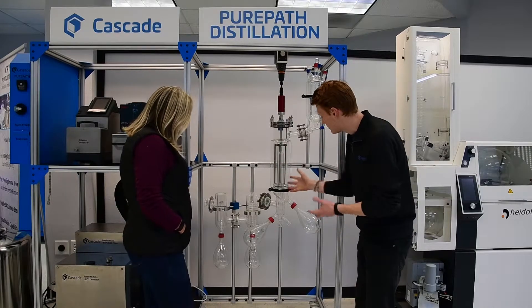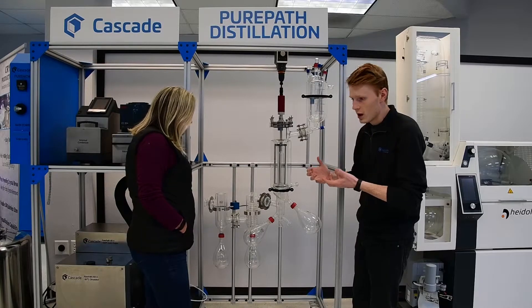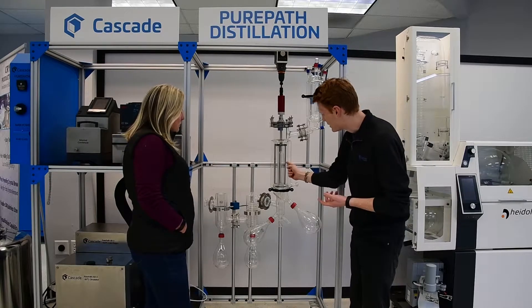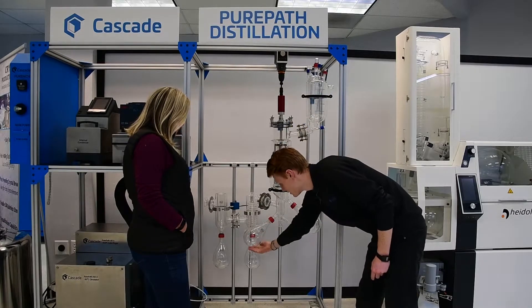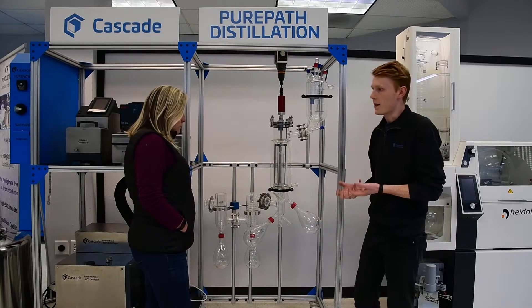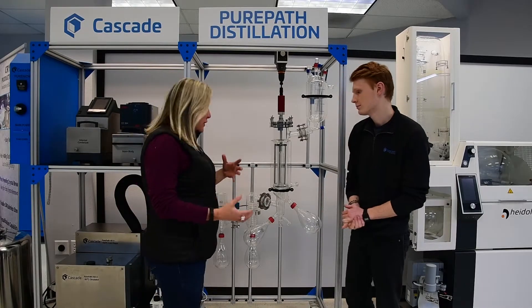We have these Teflon blades that spin in a circle to help keep the surface area of our crude oil as large as possible, so it will evaporate up, recondense on that column in the middle, and drip down into this flask where we will get a concentrated solution.